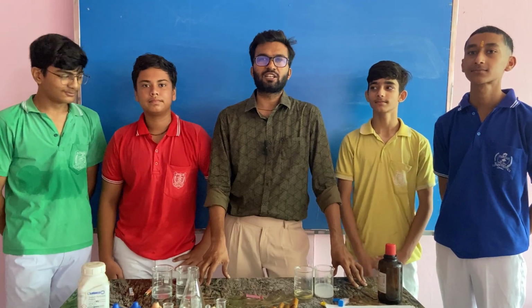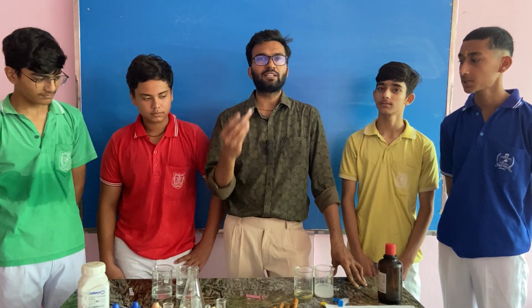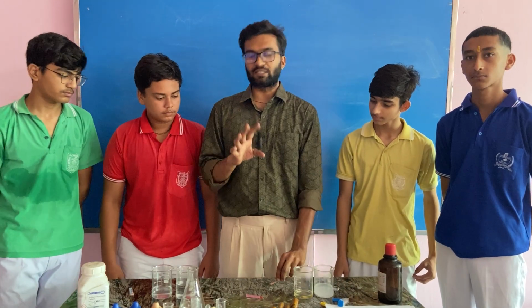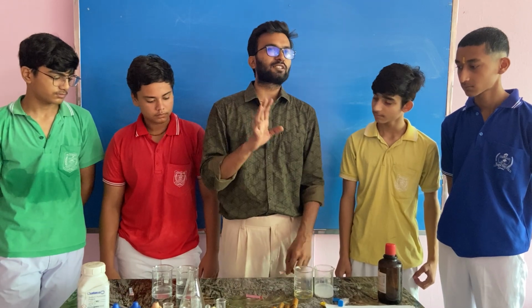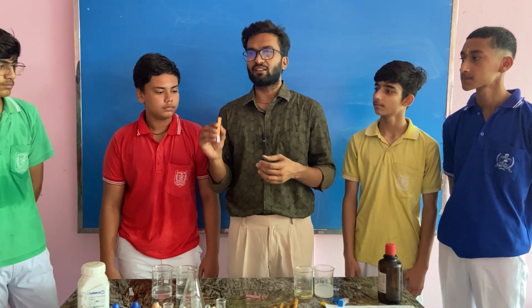Today, in this session, we are going to find the nature of the various substances by the pH paper. Okay guys, are you ready? Okay, so let's start. We have the 4 samples here, 1, 2, 3 and 4, and I will provide the 4 strips of pH paper to all these students, and let's see how it changes its color.